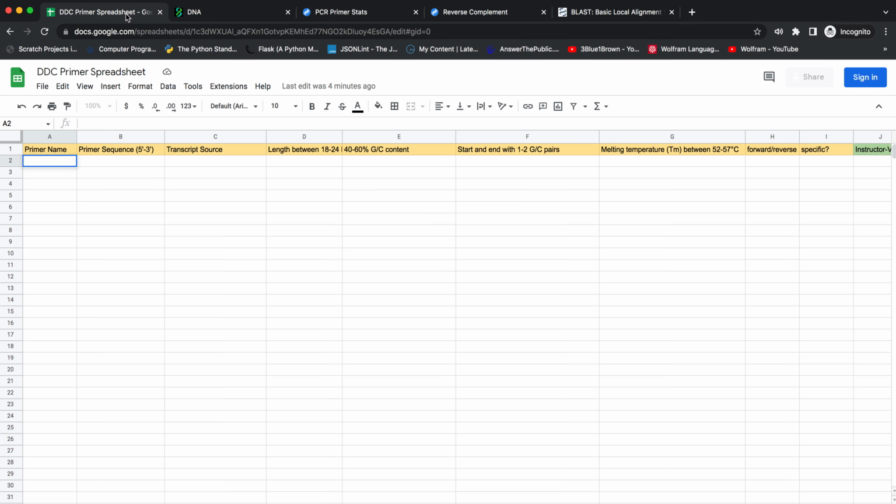If there are large repeat regions, you generally want to avoid that in a primer, because oftentimes this will then bind to many different places that have long stretches of A's, which is almost every RNA, or long stretches of T's. So we also want to keep in mind all of the other requirements. We'll check these more systematically in a little bit.